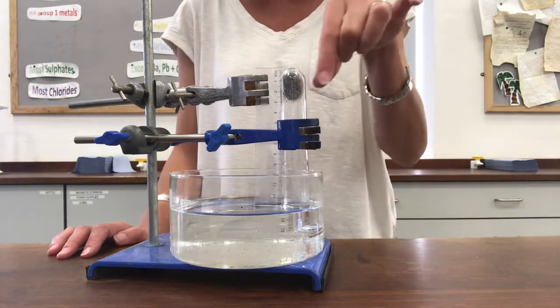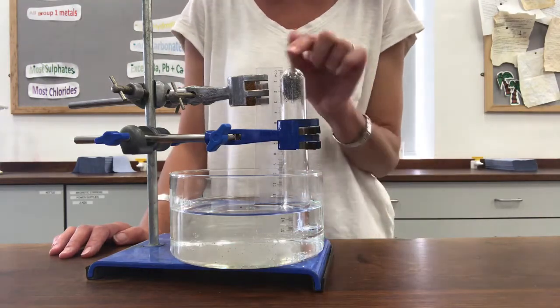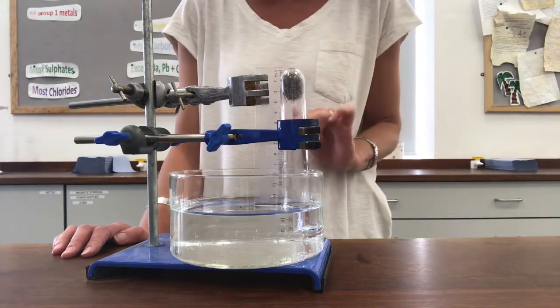As you can see, I've inverted it and put it into this dish that's got water in it. I've set up a ruler at the side here so I can measure how tall my bubble is, my air bubble that's inside there.